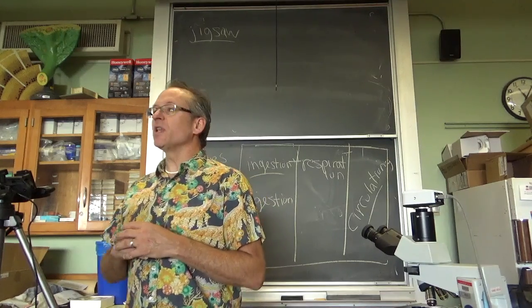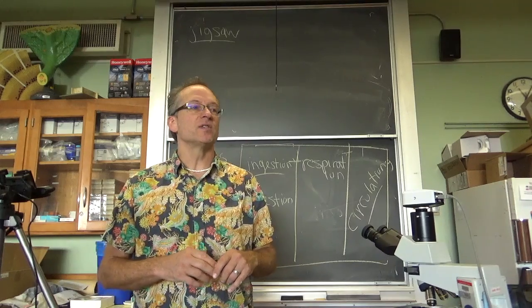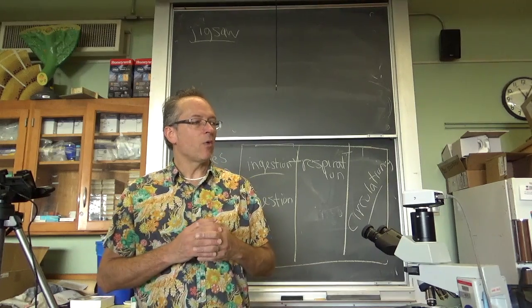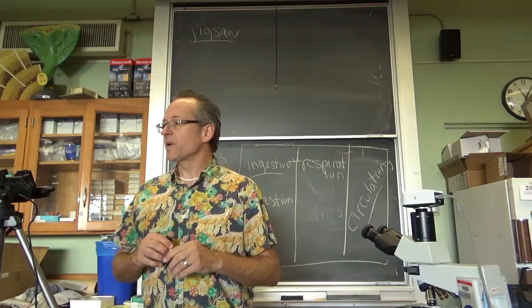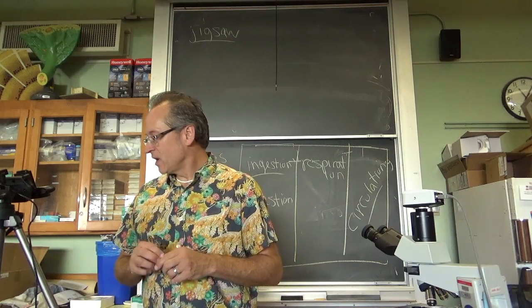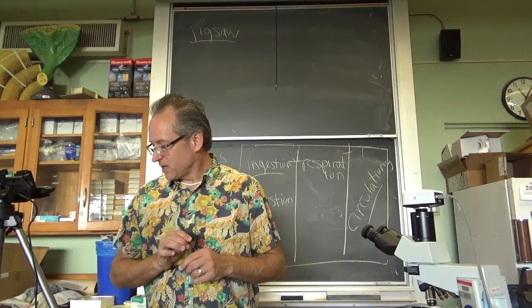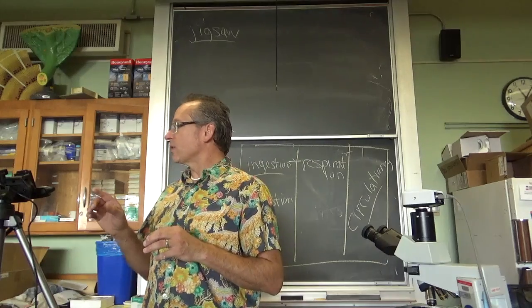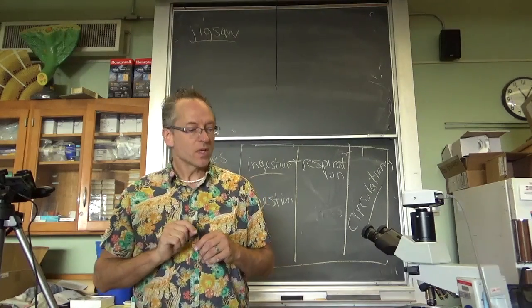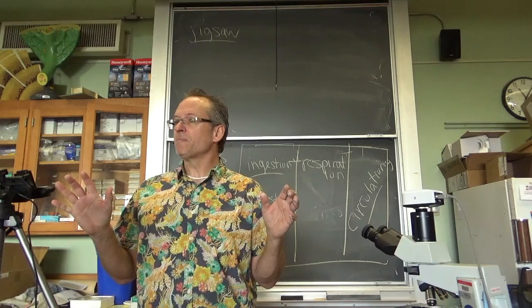Is any animal feeling lonely? No, everybody's got attention for their animals. That's nice. I'll walk around and give you some guidance and some information on the critters you have. I have the hydra up here that I'll be bringing to you, and I'm also going to be bringing flatworms over to you guys. So, questions about today?